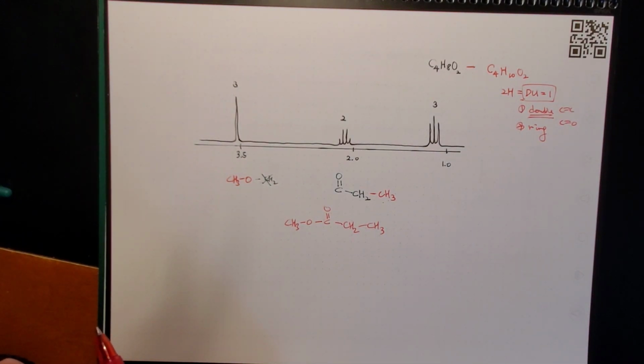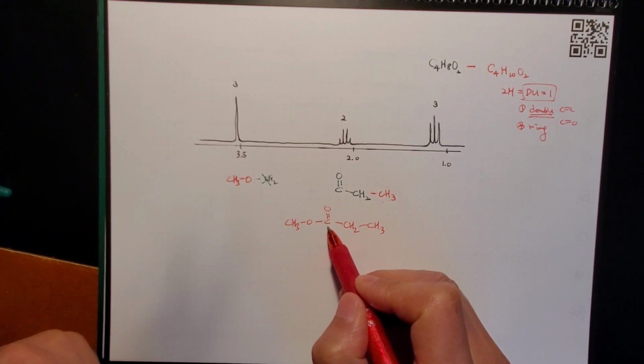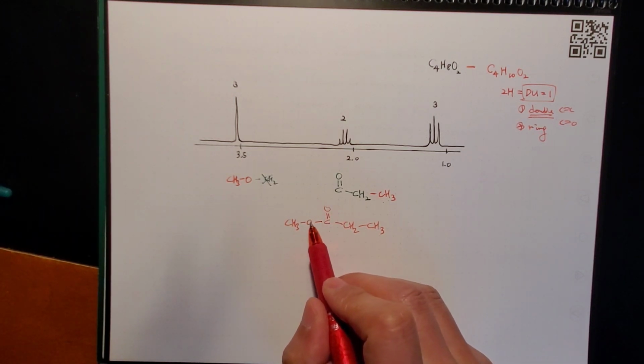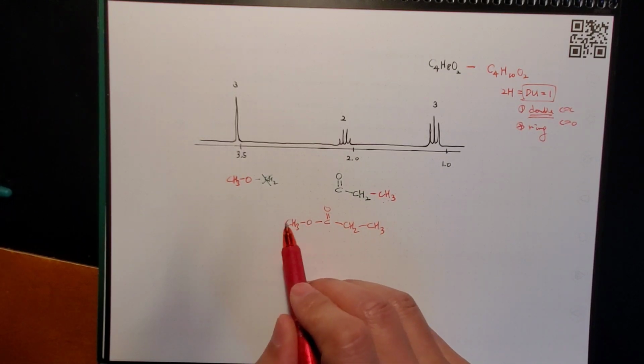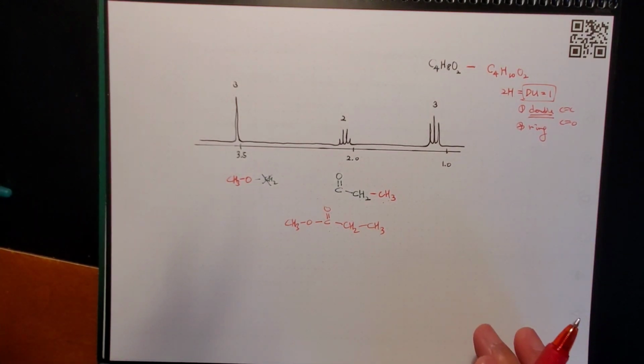So if you have IR, what data you look for is the ester, right? The ester carbonyl group is around 1735-ish. You look for that. And also an intense signal for this partial double bond due to the resonance, 1200, 1300, that kind. And then here you expect around 1000. Then the rest of the signals are all sp3 CH stretchings and bending vibrations, right? So you could do it without IR.